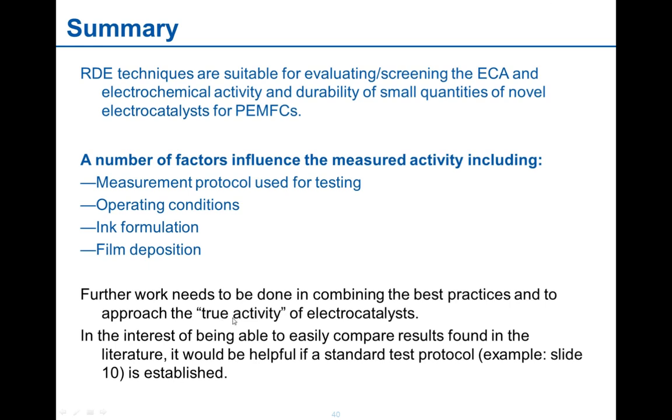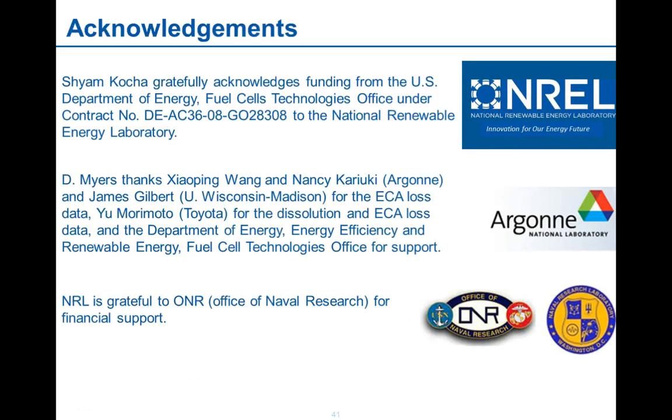One of the things in RDE is that it's important also in a fundamental sense to try to approach the true activity. No one knows what the highest value of the true activity of the catalyst is, which is assuming the mass transport resistance of 0, but that may not be the case as of yet. So in the interest of being able to compare results, it would be good to have a standard protocol. In slide 10, I had a rough suggestion of what such a protocol would be like.